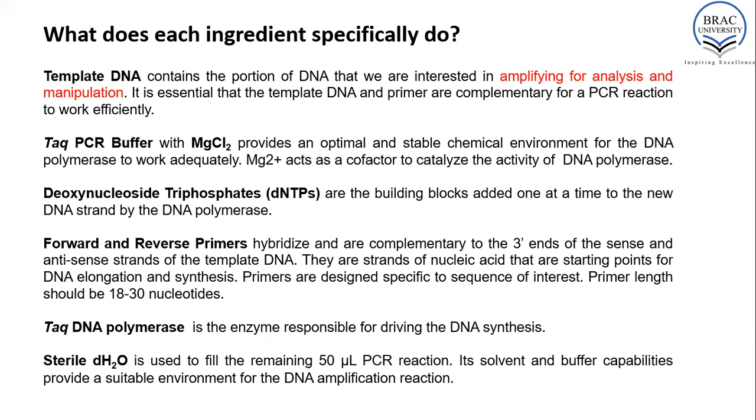And obviously, the final component is sterile water, which is normally deionized water that has been sterilized before use. So if all of the components are right and in good amounts, but your water is contaminated, then your PCR won't work. So water is a very, very important component of the PCR reaction.